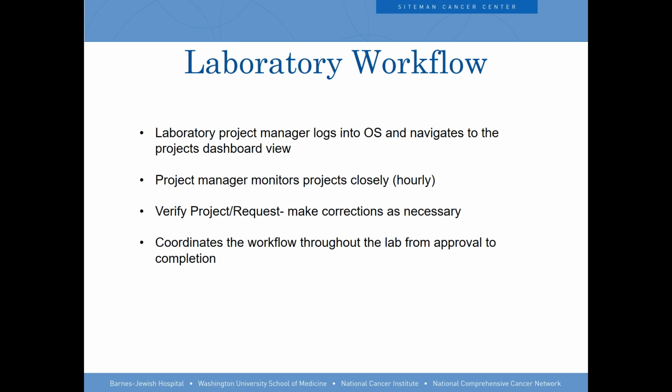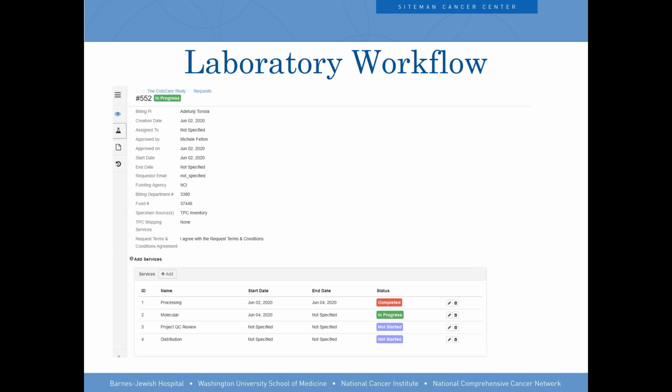So since we turned off notifications, one of the workflows was that this person would get notified every time a request would come in, and they could manage that out of their inbox. But really what we found is they live in OpenSpecimen. They just live in the project's module and watch requests as they come through, keep an eye on them and process those as needed. So that's their main charge as far as that type of project management and facilitation through the laboratory.